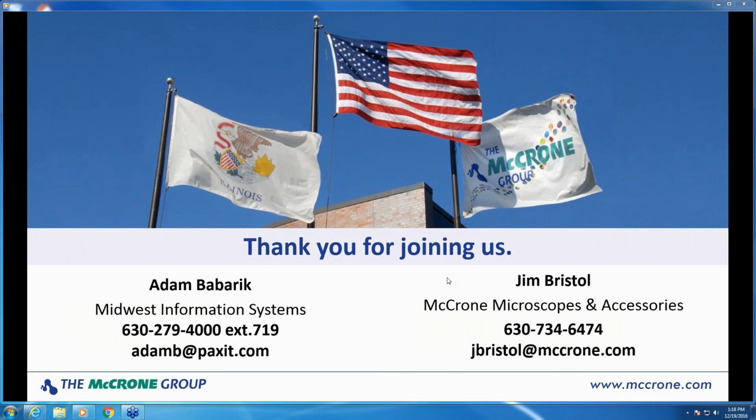Yeah, in particular, many applications have different needs. PAXit has always been modular. In fact, this extended security software is, at its core, a module that integrates with PAXit as it's been developed for 25 plus years.